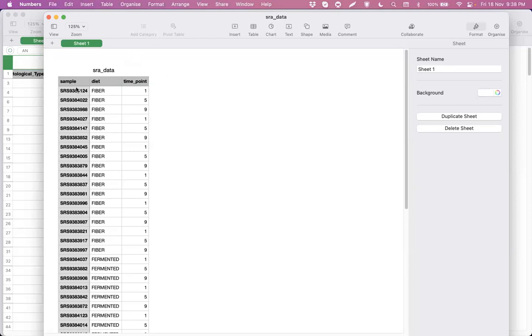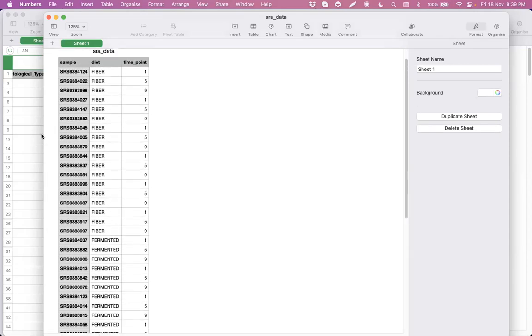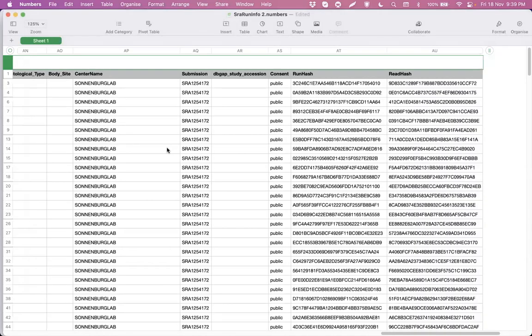So this txt file, right, as discussed earlier, will go as a sample file or sample metadata, like how Sonalika described how to prepare that file, and she will also help you if you have such data. But that is useful for the DADA2 pipeline. But for the QIIME pipeline, we don't want to do that. There is no associated metadata file that you have to upload. So all the metadata information has to be included in the run information itself, right?